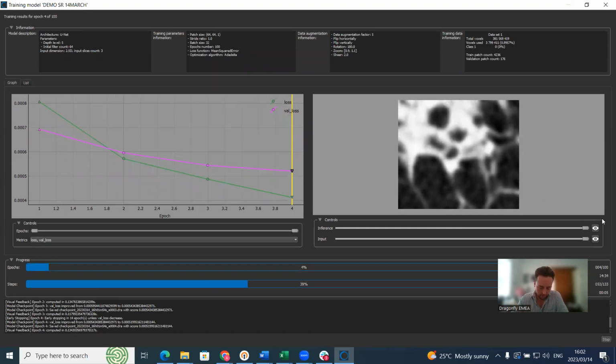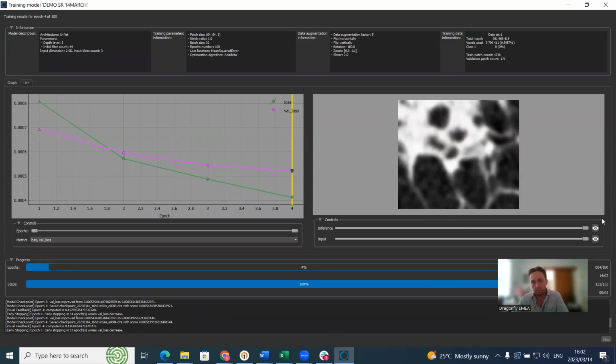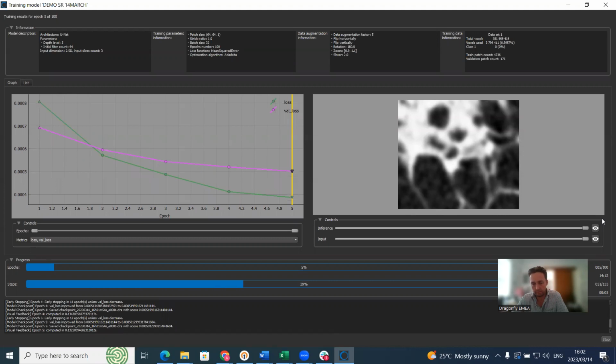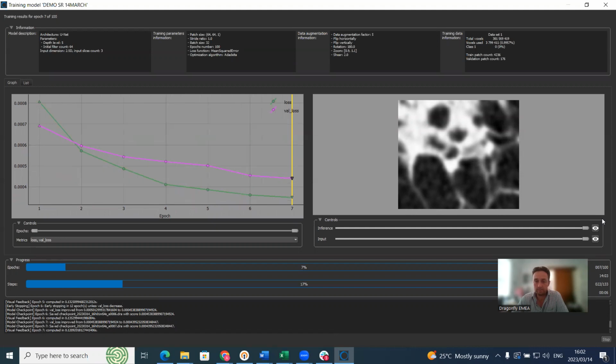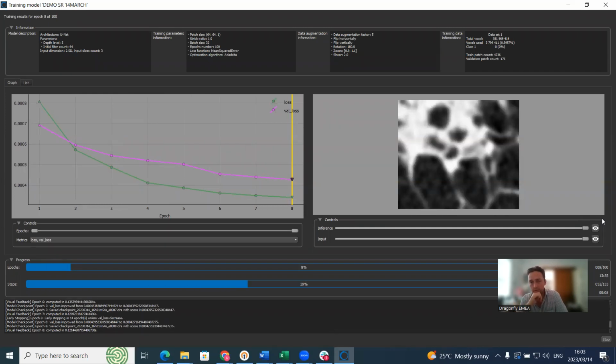And you can then apply this model to the original data in the same way as with a denoiser model, or you can use the same approach not only to do super resolution, but also super contrast, which is the same thing, just acquiring scans at the same voxel size, but with, say, for example, a 3-hour scan versus a 10-minute scan, and enhance the contrast of a 10-minute scan with information from the 3-hour scan. So many things are possible.